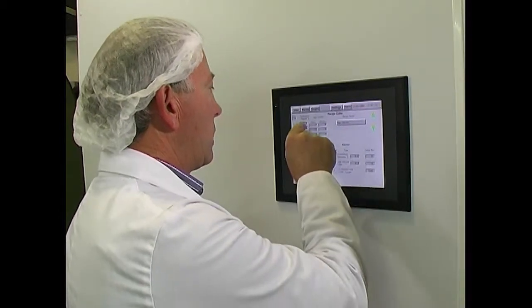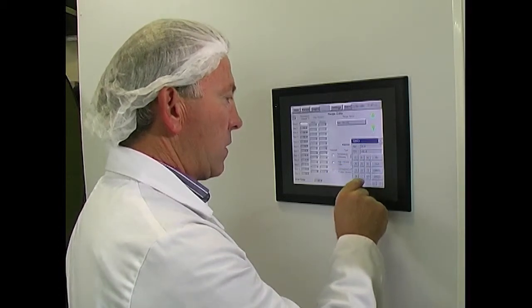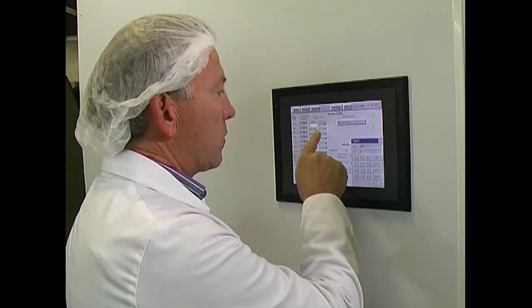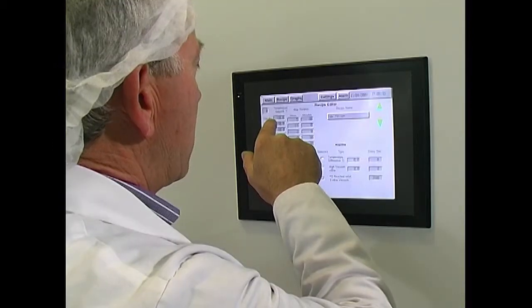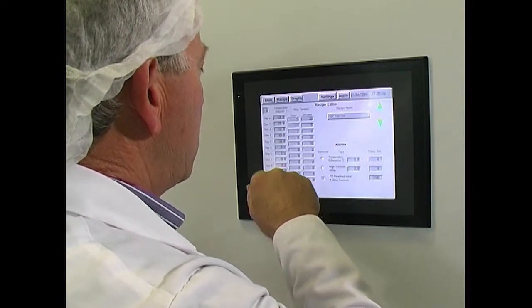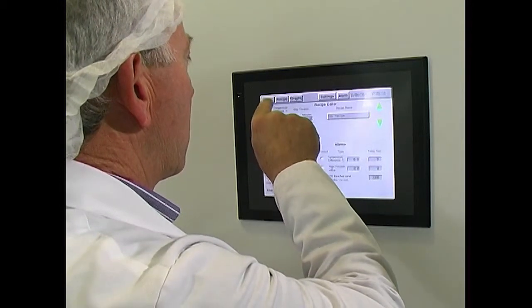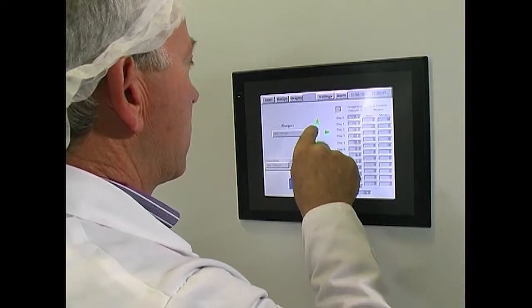New recipe. You can then change the temperatures through these minimum and maximum to a new value, minus 20, new temperature. Same with the time, 5 hours. So we start at 20, ramp to 60, hold at 60, ramp to 40, ramp to 30. Our final end temperature can be set. The new recipe is then stored and added to the list of available recipes in the controller memory. Now we can scroll up or down and find recipes.